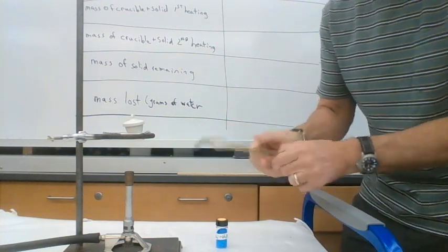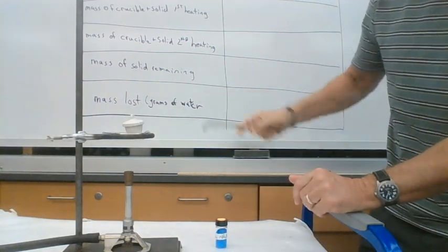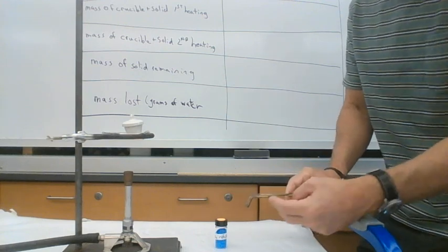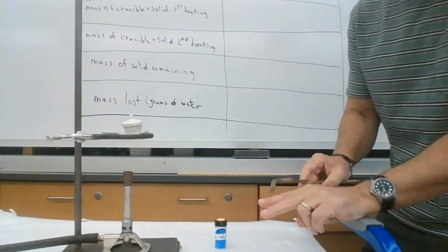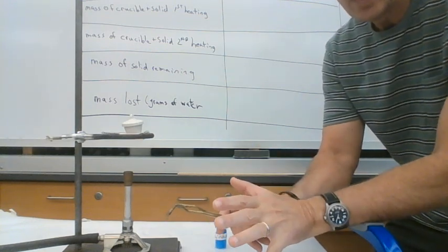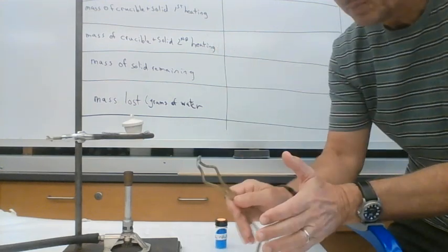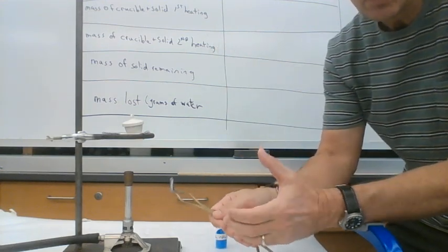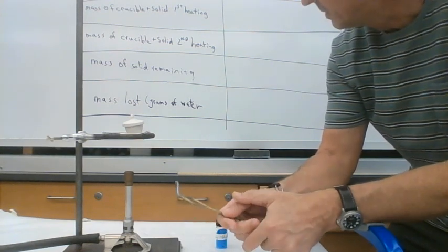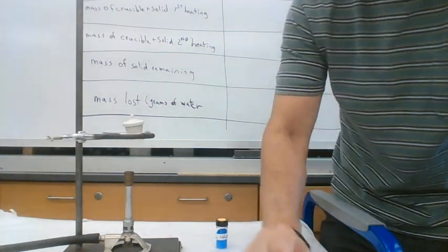Then we're going to bring it back, set it up, heat it up for another 10 minutes, let it cool off and weigh it again, and get the mass of the crucible after the second heating. If those two numbers are relatively constant with each other, that means we've heated it enough to drive off all the water of hydration. If those two weighings differ substantially, then we would heat it again, because that would mean there's still some water bound to that material and we need to drive that water off. So that would be the data that we would collect for this experiment.